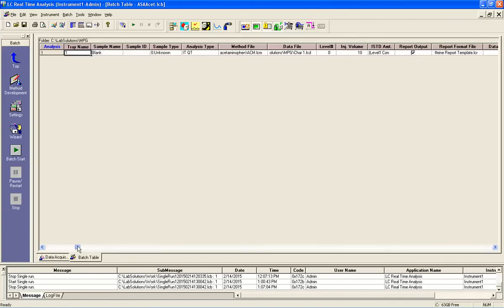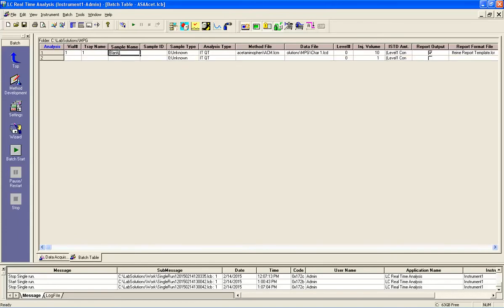There's other stuff over there that I need to pay attention to. And the very first column should be vial number. Okay, so vial number 1, tray name number 1. What did I put into that spot? Well, that is a blank. That's all that's there is a blank. So I'm going to type blank in.